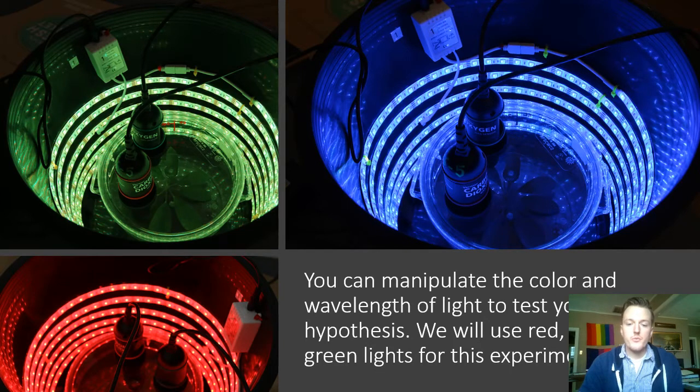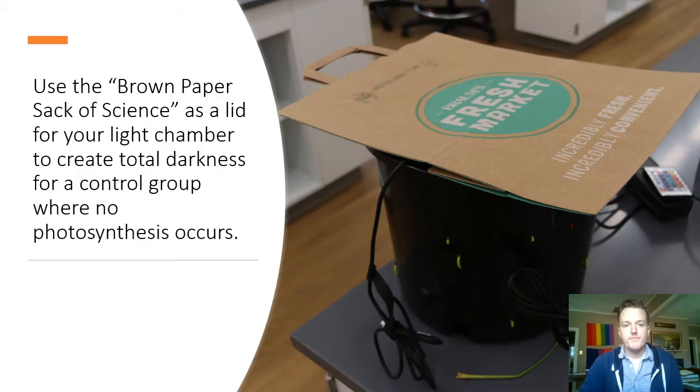You're going to be using red, blue, and green lights for this experiment. And so when you think about that rainbow gradient, you're looking at where these are falling on those areas. So the beginning, middle, and end of the visible spectrum of light.